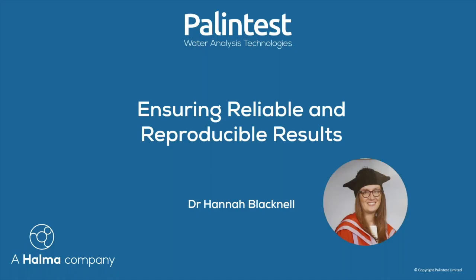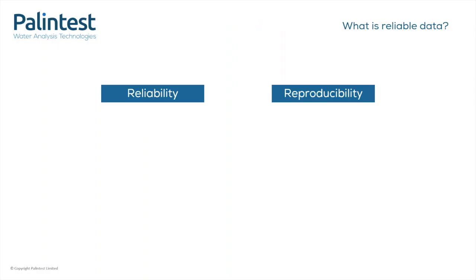Thinking about two other words, they're really closely linked to the two definitions that we've already discussed, and that is reliable and reproducible. So as well as accuracy and precision, there are two other words that are thrown around a lot in the water testing industry. You want data that is reliable and reproducible, but what do these mean? So reliable data generally means that you can trust it, but really the only way to know whether you can trust it is to see if you can do it again. Well, that's reproducibility.